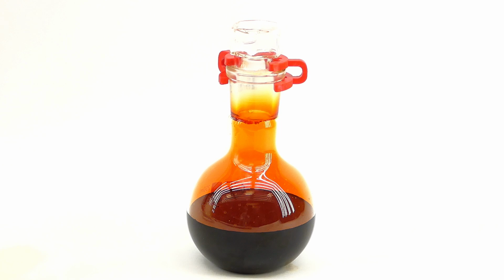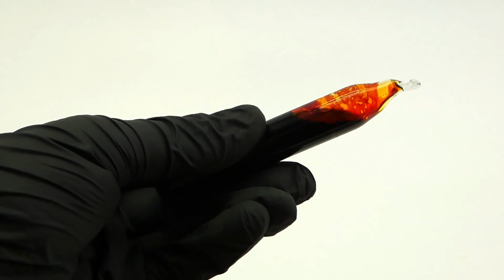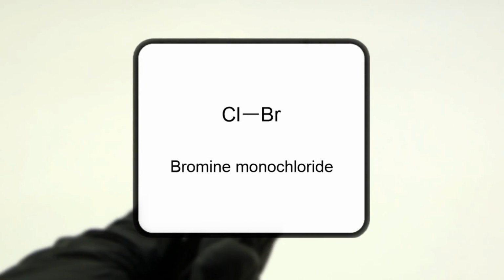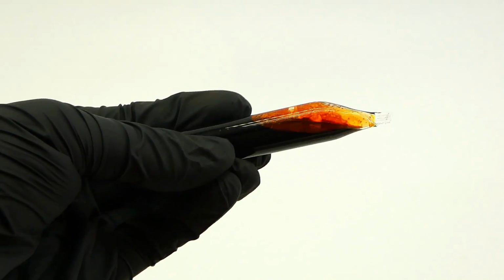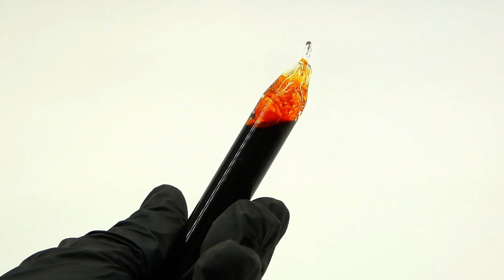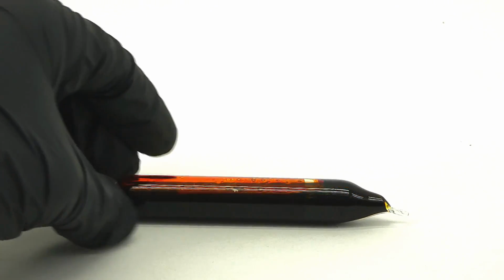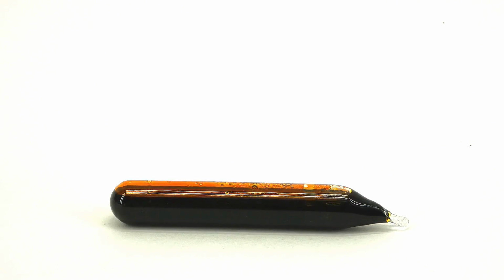The second issue is that there is chlorine present, which can actually react with the bromine to form an interhalogen compound that slightly contaminates it. Like I said, for most applications it is fine, and it doesn't change the appearance or physical properties of the bromine in any way, but for a complicated chemical synthesis, the bromine has to be really pure, and any chlorine can completely screw things up.